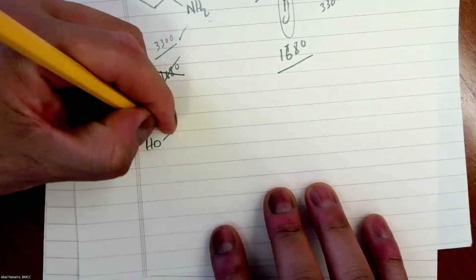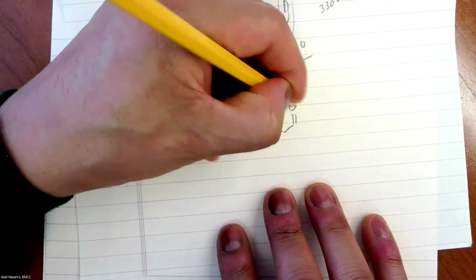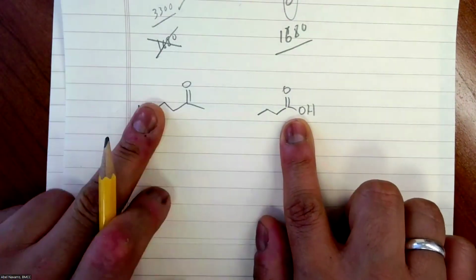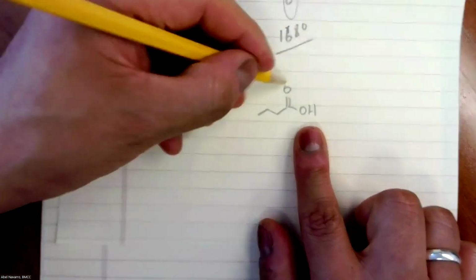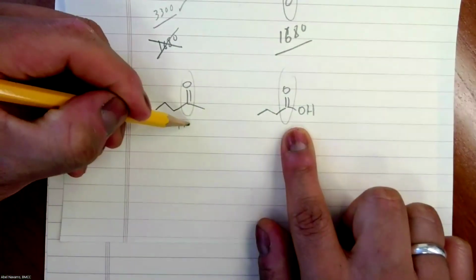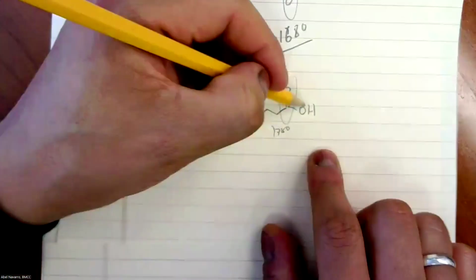Okay, another one. I think we went over that a few minutes ago. Okay, can I use the C double O? No, because the C double O is the same. 1700, 1700 are the same. I can't use that. The difference is the OH.